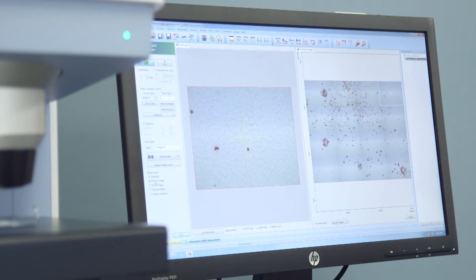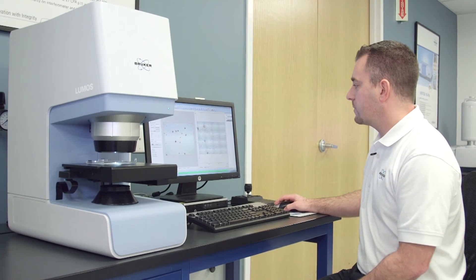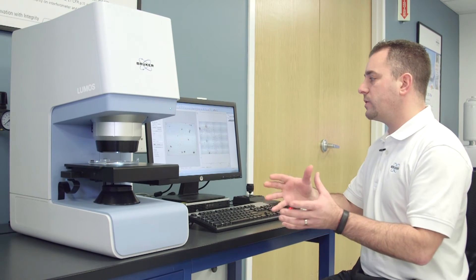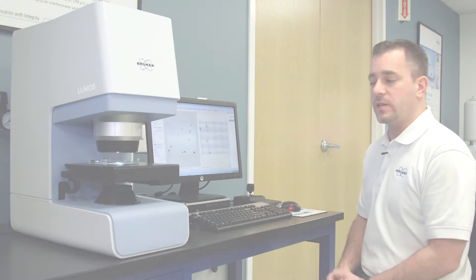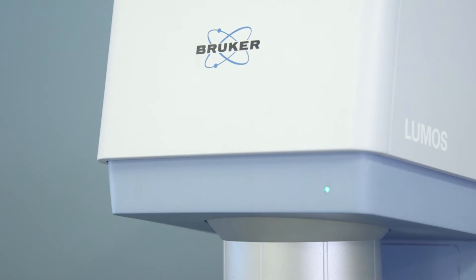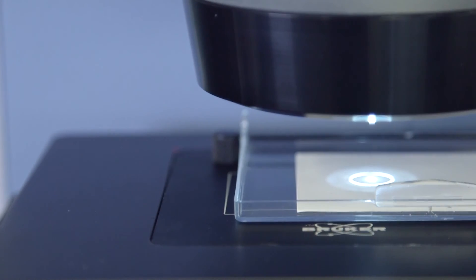Now I can still just use the mouse here and click to individual spots on my larger image and you can see my live image moves to those places automatically. Once the sample is on the stage there's really no reason for me to go back to the sample stage or go back to the microscope because there's no knobs, everything in the system is completely automated.